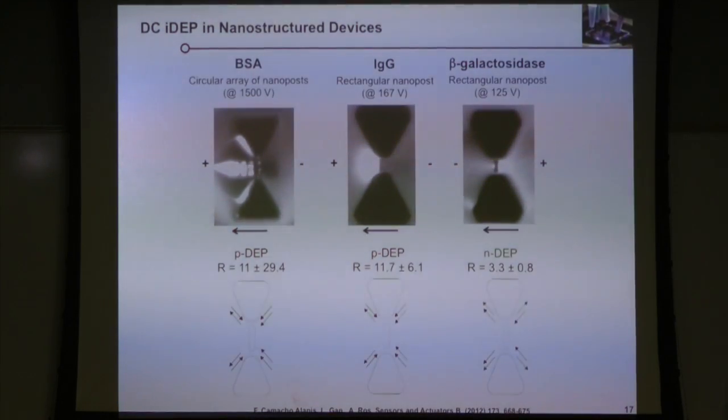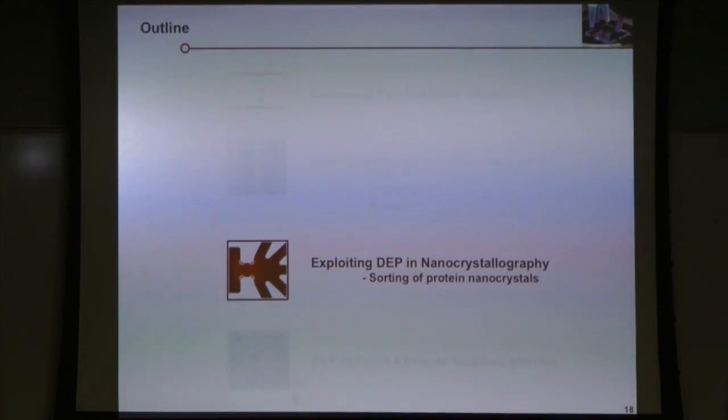And then we can actually extend over an entire microchannel that is a few centimeters long, and that's our problem. So this is a manual process where you have to actually mill each hole, and so we're looking into something that we can do through photolithography, so that we can construct a separation system.